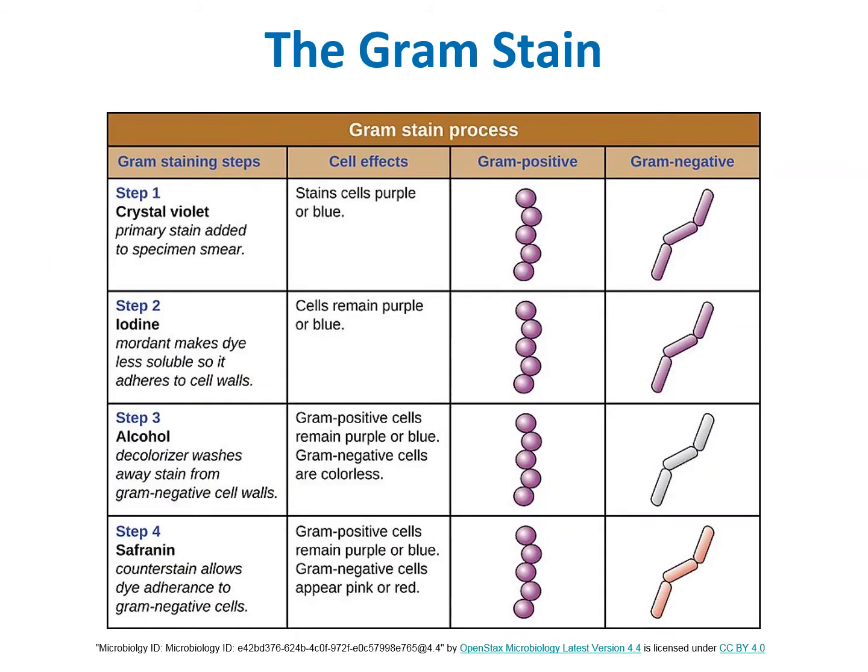Why do we need to stain bacteria? We stain bacteria because they are colorless. If we don't add color to these cells, they'll be very difficult to see. During a Gram stain, you take bacteria and you apply them to a glass slide. Now remember, the bacteria are colorless at this point. You allow the bacteria to dry, and then you pass them through the flame of a Bunsen burner.